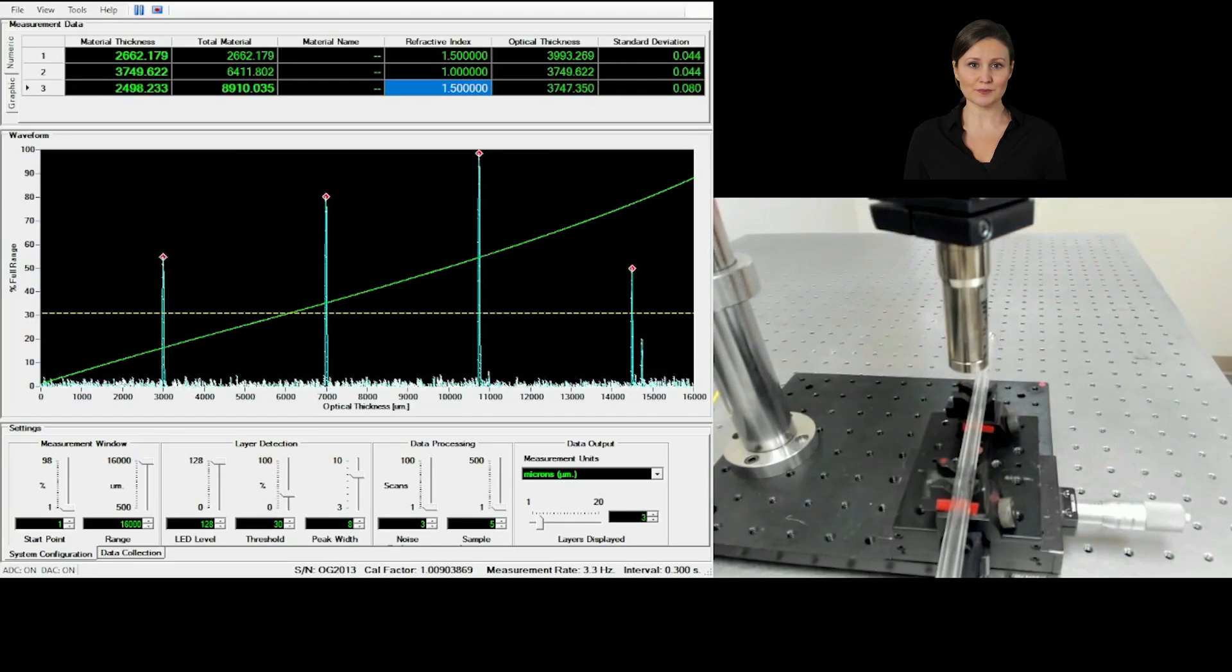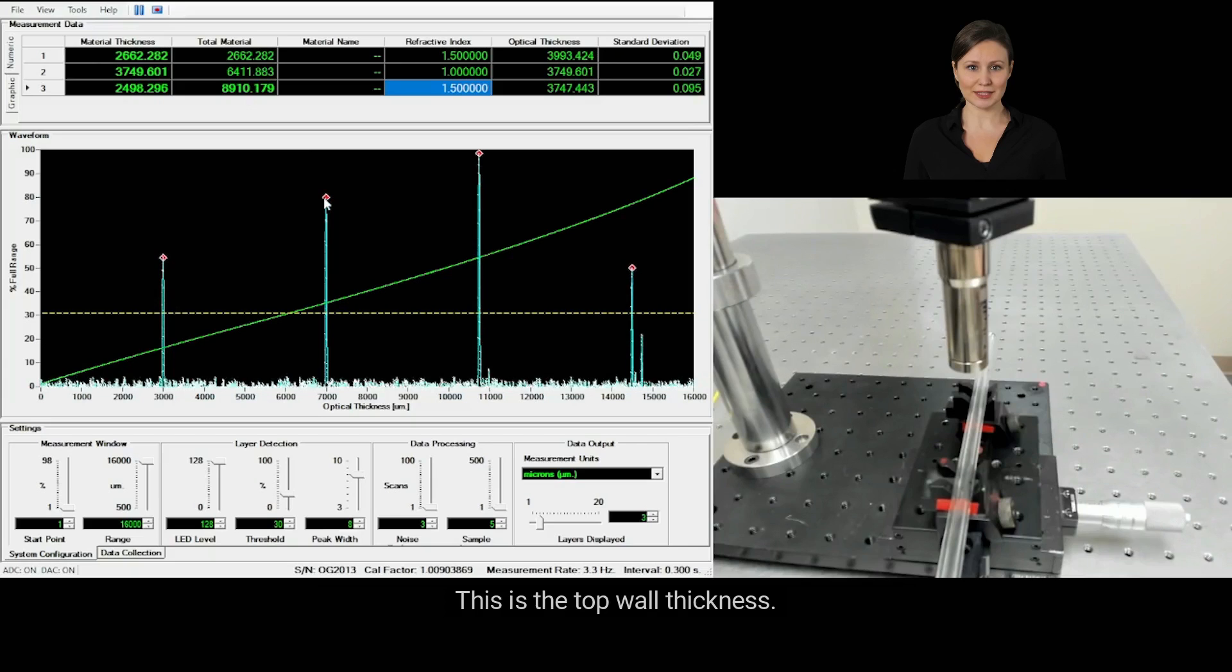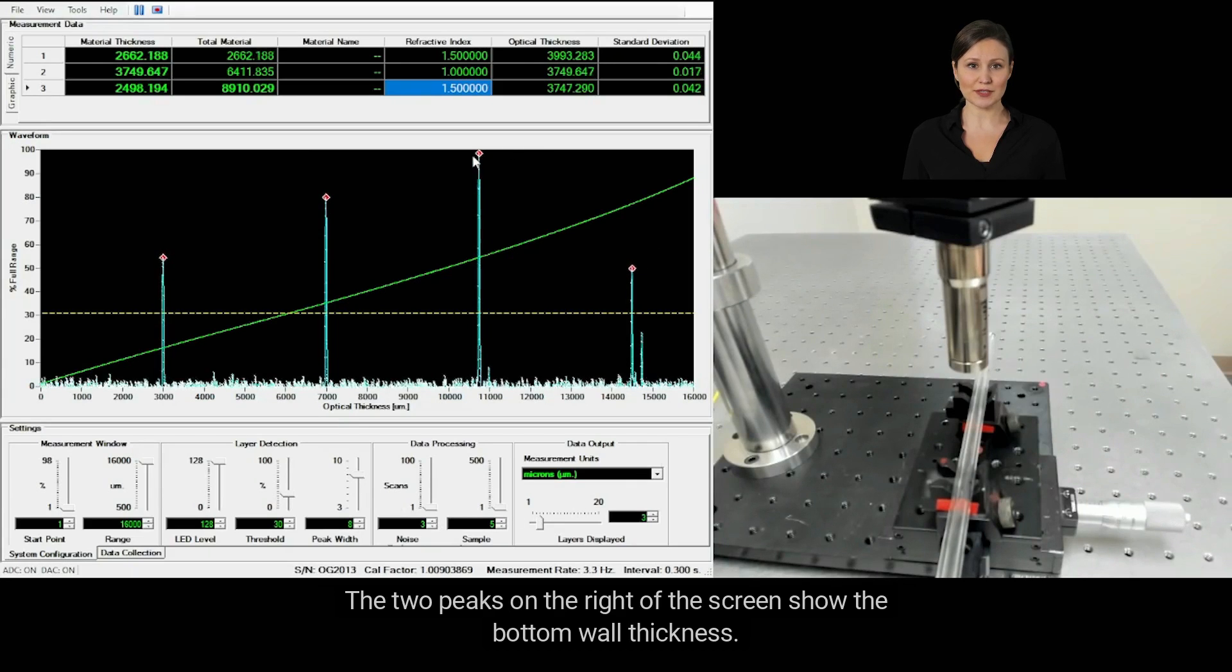The inner and outer surfaces. The two peaks on the left show the distance between the upper surface and lower surface of the top wall of the tube. This is the top wall thickness. The two peaks on the right of the screen show the bottom wall thickness.